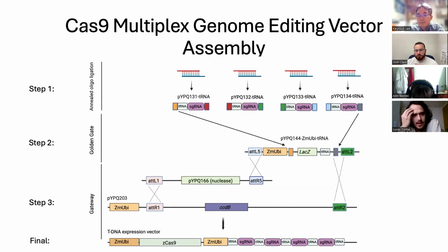Yes, thank you very much. I didn't know that about the tRNA recruiting the polymerase. And just one extra thing, because you've mentioned that you had efficiencies such that you only needed to screen for 1 or 2 colonies, and that almost made me cry because I had to screen up to 30 colonies. One thing that was very common to me when screening colonies is that, when sequencing those colonies, we had vectors that would lose the ccdB site and close on the edges. Is that common? Does that happen to you?